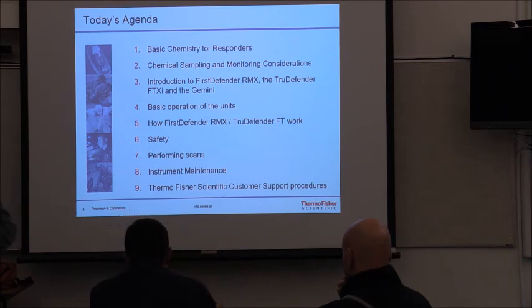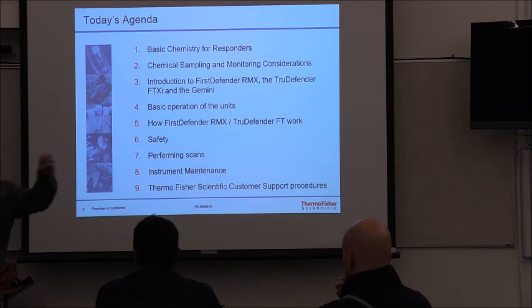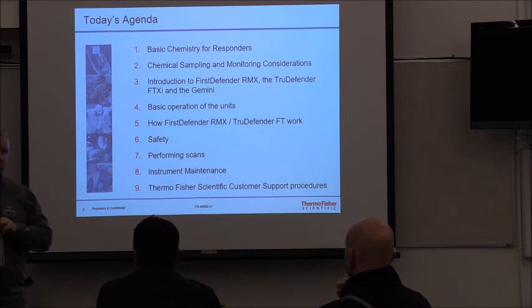Raman shoots a laser, and a lot of people love it, they fall in love, and they're like, man, I can go fast, I can go sample, sample, sample. Then I go to FT, and it's like, oh, I slow down. And in FT, you've got a little diamond. Same with on the Gemini, you've got a little diamond. You have to clean the diamond, you have to run a background, you have to run a sample. It's always a three-step process when you're doing that. Okay? Raman's a little bit different, and we'll run through all that.